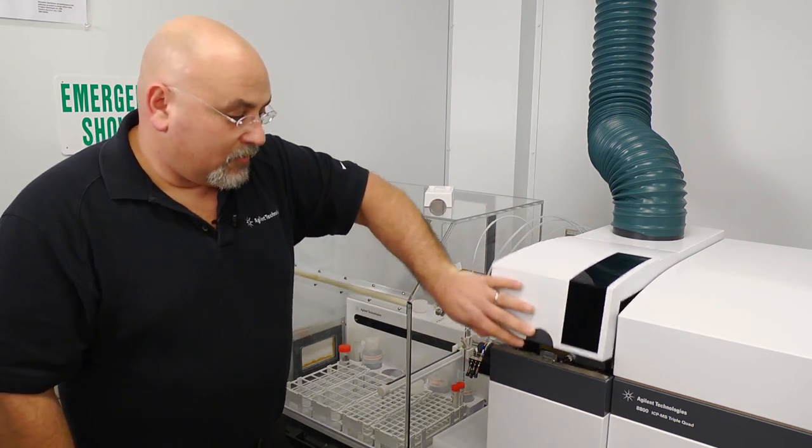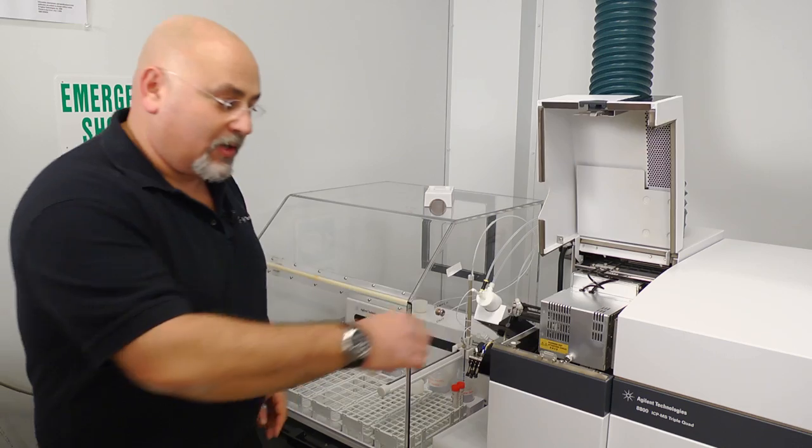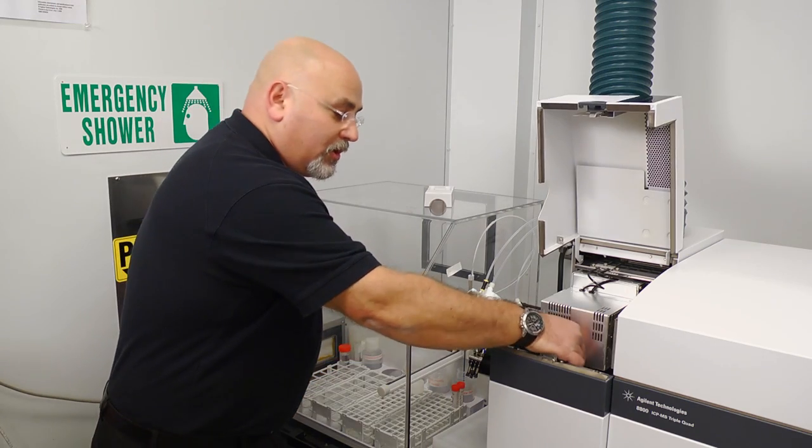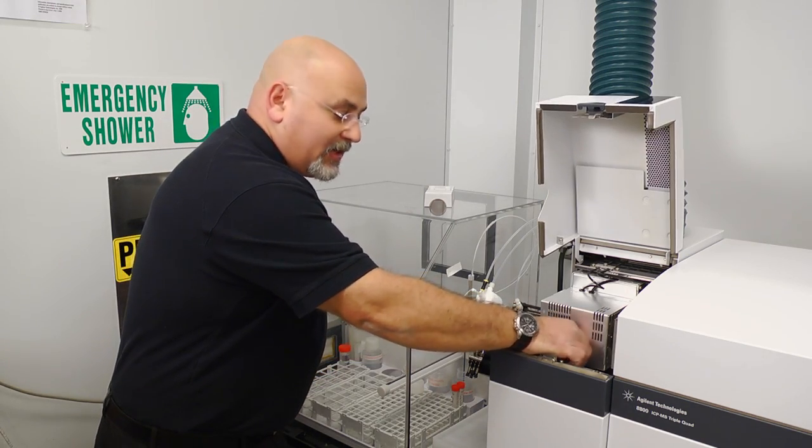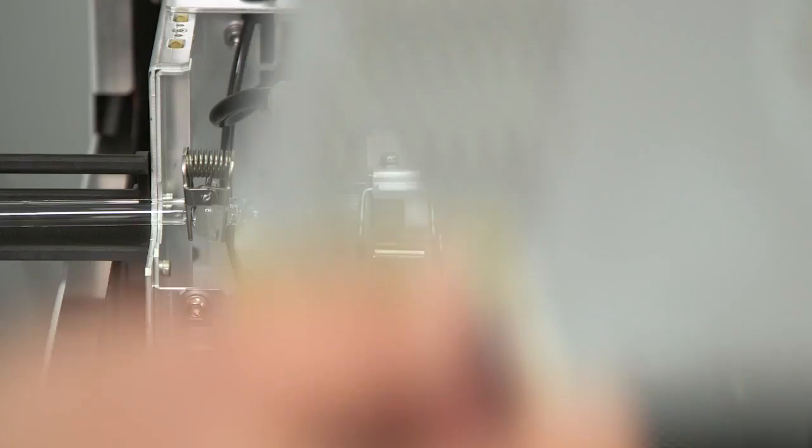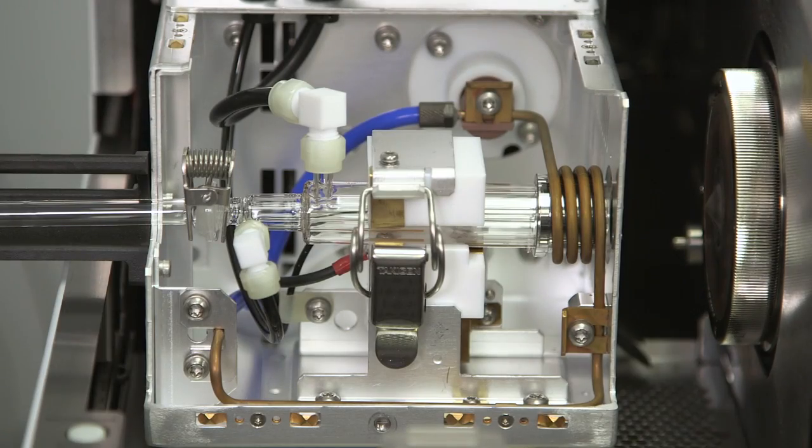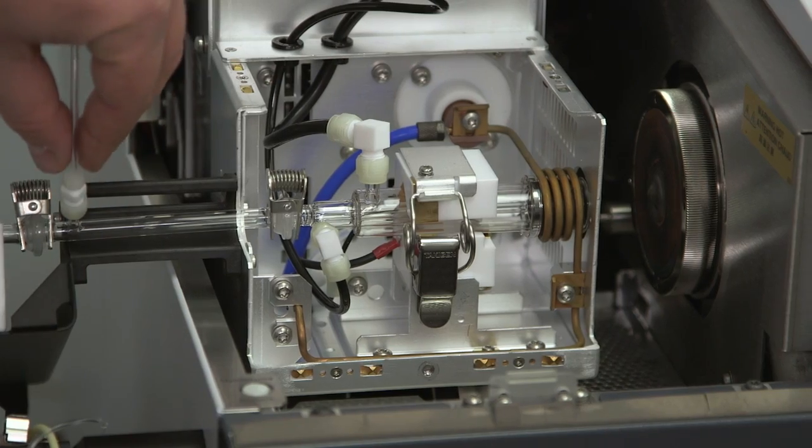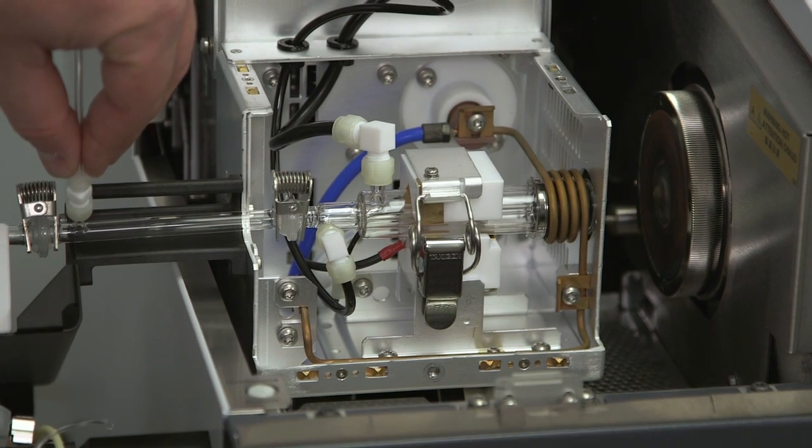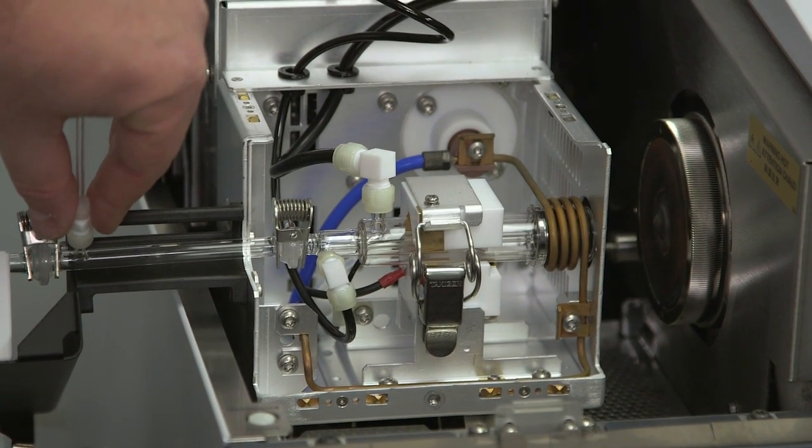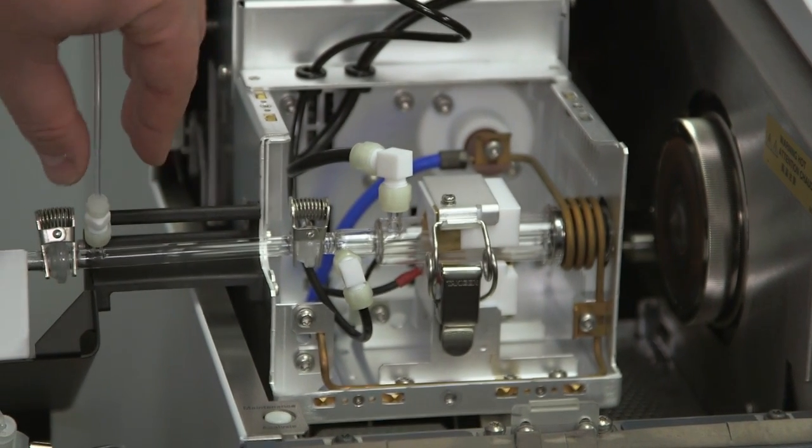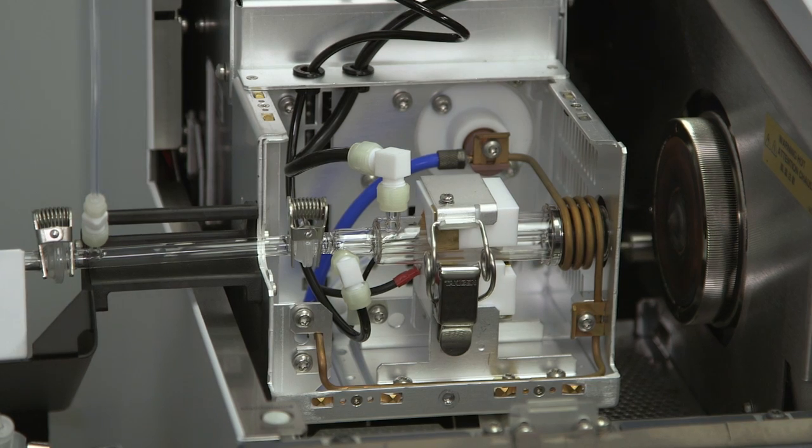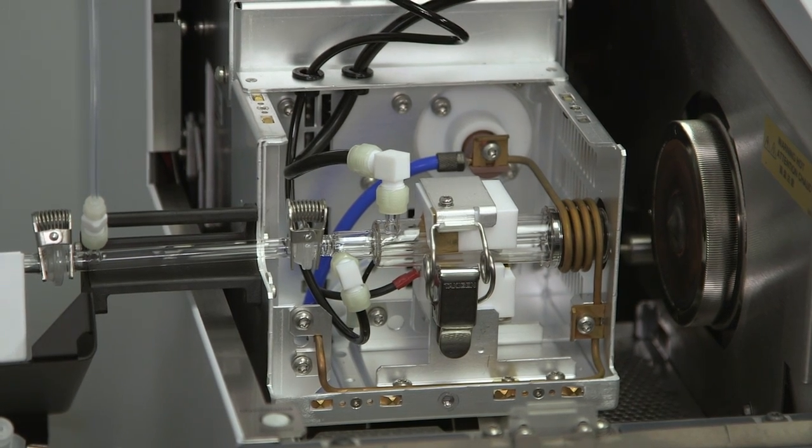I will now open the latch to show a closer look at the inside of the sample introduction. Right up front, we can see that we have the high matrix interface that would allow you to do aerosol dilutions, which is a high capability of any of the Agilent ICP-MS systems.